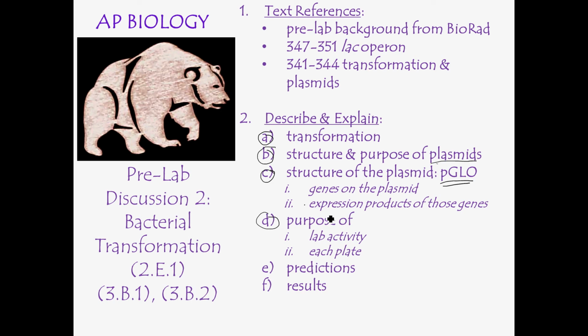Then also the purpose of the whole lab activity in general, as well as each of the 4 plates that you have there. You should be able to describe and explain any predictions you're making, as well as ultimately explaining the results. So why do we use the plates? What do the plates show? What's the whole purpose of this activity? This isn't really so much an experiment as it is an activity to demonstrate some of these principles that we've been talking about in terms of gene expression and regulation of gene expression.